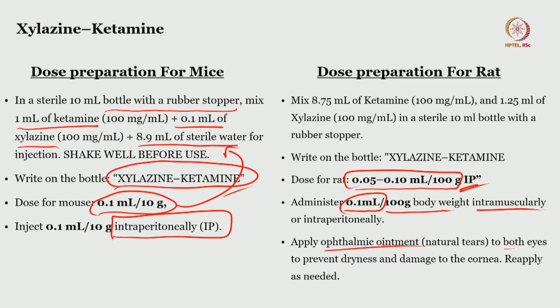So, that is the end of all the drugs that are used in anesthesia, both injectable and inhalational, and these are all the equipment that is used. These are the minimal requirements for general anesthesia usage, without which your setup is going to be compromised and you will endanger the life of the rodent if any of this apparatus is lacking. And if it is really expensive and you can't afford it, ketamine xylazine is a wonderful combination of injectable anesthesia, especially if your procedure is a short one lasting around 20 to 30 minutes.